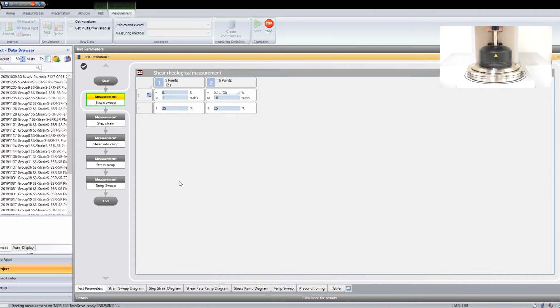First, we start measuring the properties of a gel in oscillatory mode, because we are interested in the elastic and viscous components, or storage and loss moduli. In your dataset, you will find the frequency sweep measurement, but we skip it here as it takes 1 hour. As my colleague mentioned, we start with a strain sweep where we keep the frequency constant and increase the strain to see the yielding phase of the material.